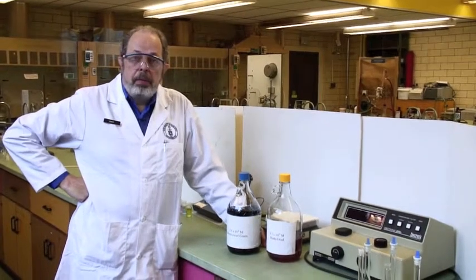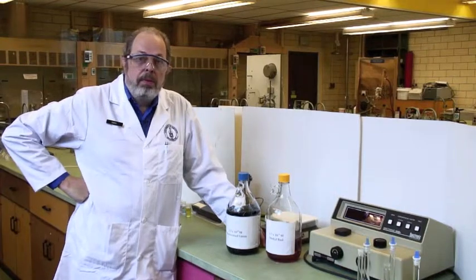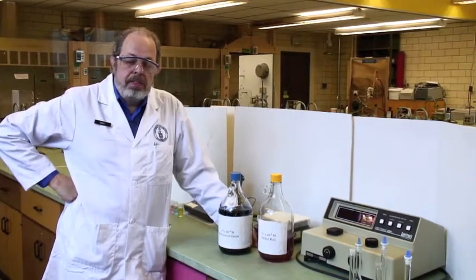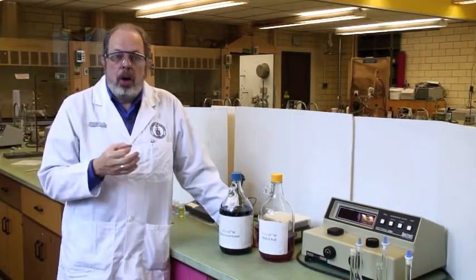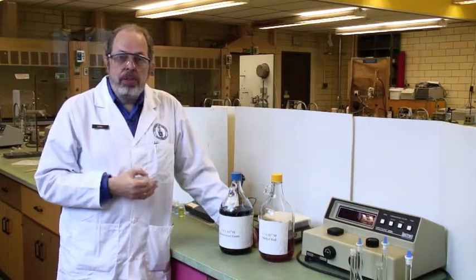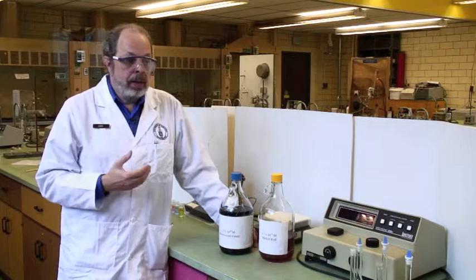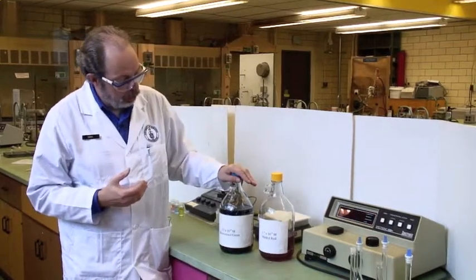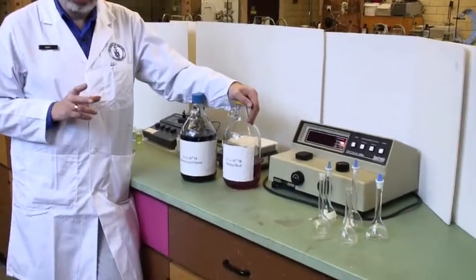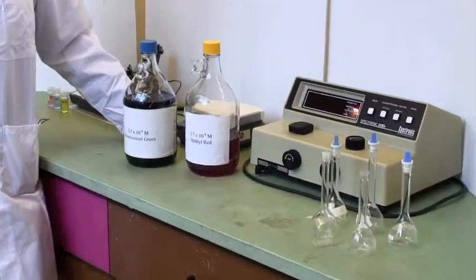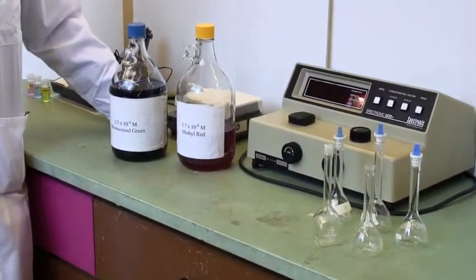This video is to help you with experiments Q3 and Q4, which is the chemical equilibrium of acid dissociation of a two-color indicator. For one experiment you'll be using bromocresol green, for the other one you'll be using methyl red. Other than that, the experiment is pretty close to identical.